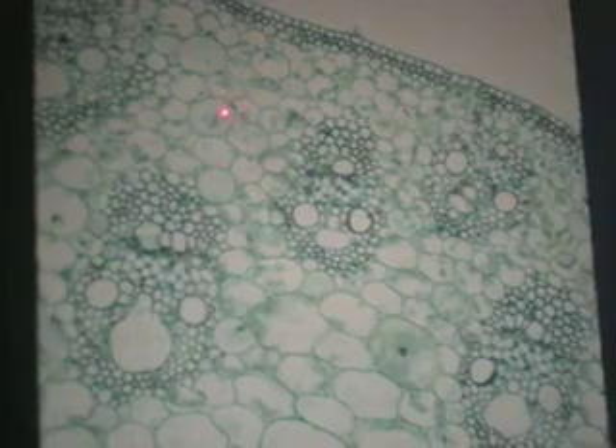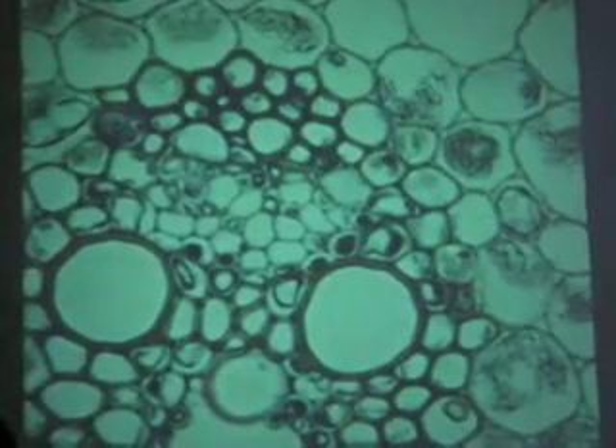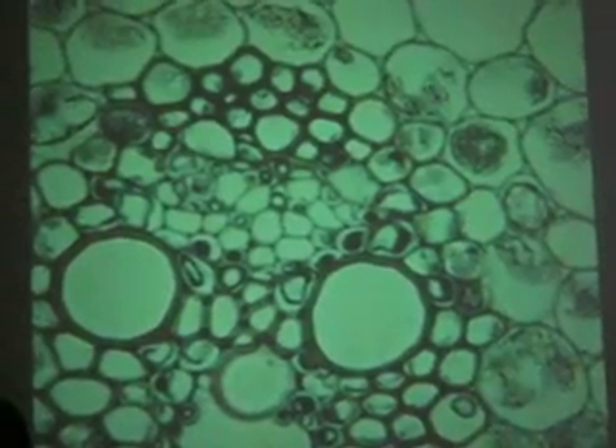Number 8, monocot stem — corn. How do you know it's a monocot stem? Multiple vascular bundles scattered all over with no order. There's some collenchyma right under the epidermis. Here's the parenchyma — see how one parenchyma cell can get almost as big as a vascular bundle. At higher power, there's the epidermis, then collenchyma, then parenchyma. See the cytoplasm? Here's sclerenchyma — it's stained red, but it's sclerenchyma.